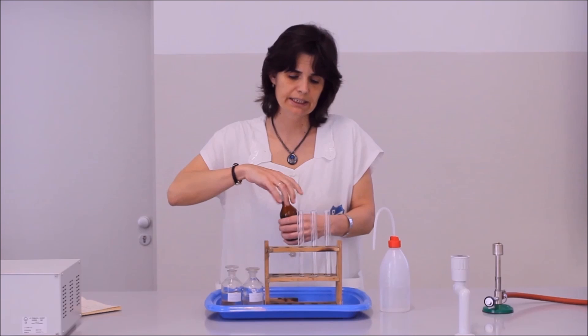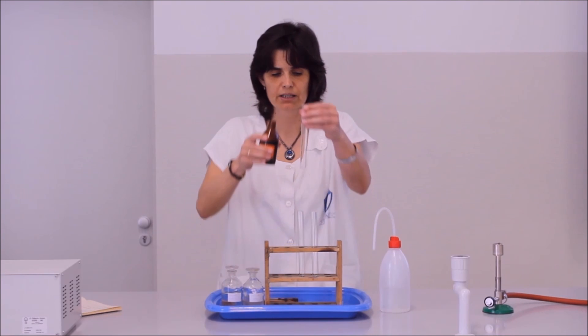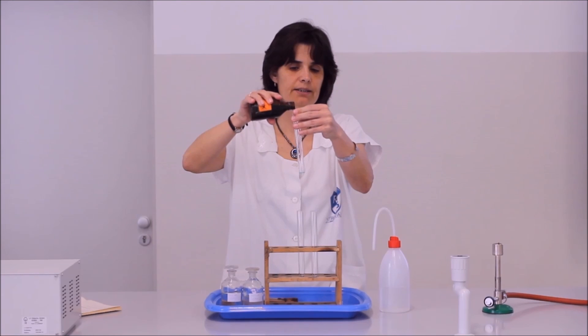Először is részszorfát oldatot fogok önteni minden három kémcsőbe, körülbelül 3,5 cm-nyit.